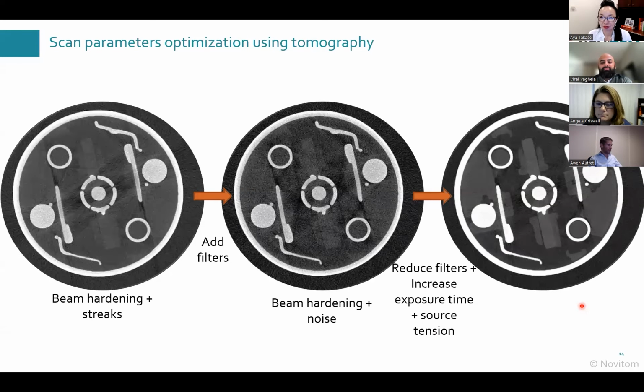Yes, we hope to have something that helps the perhaps non-expert user of tomography, but also the expert, because sometimes it could be quite difficult to find the perfect setup. Yeah, you can see the challenges of that. That's why it's user defined right now, and hopefully in the near future it changes and gets a lot less user defined, more automated, and machine learning on its own. Okay.